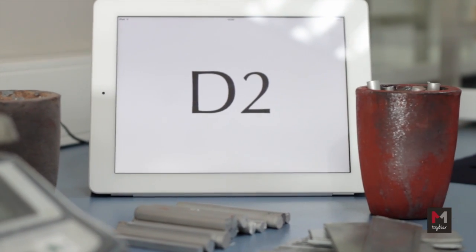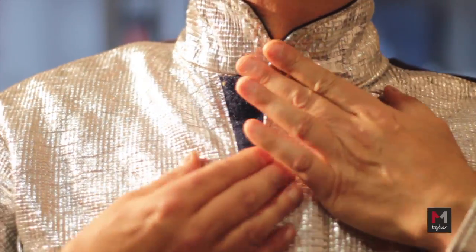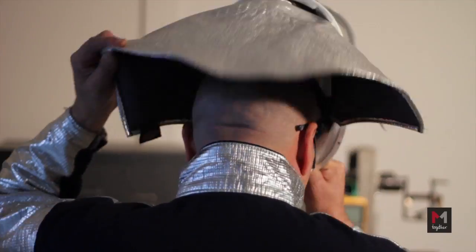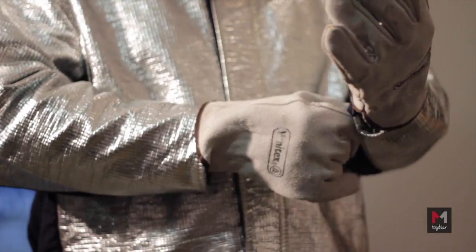The test method is mainly carried out with the following metals: Aluminium, Iron, Copper, and Cryolite. The D-code value is for Aluminium and the E-code value is for Iron and Steel. There are three levels for each metal.